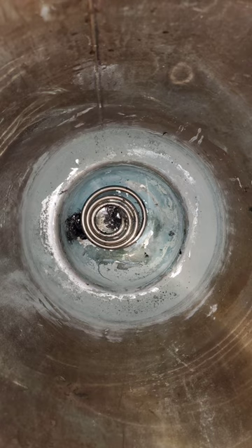As you can see, the steam is coming out.